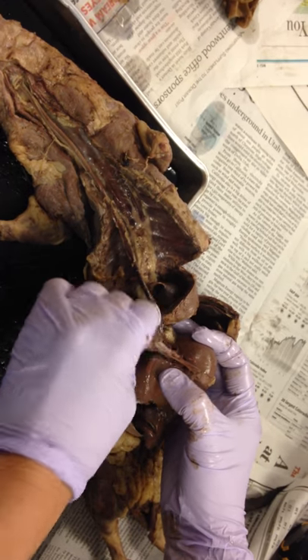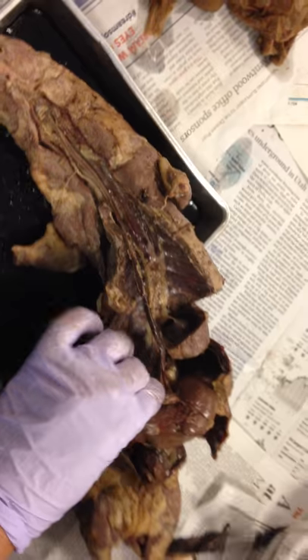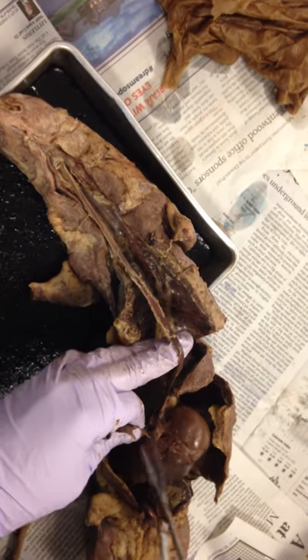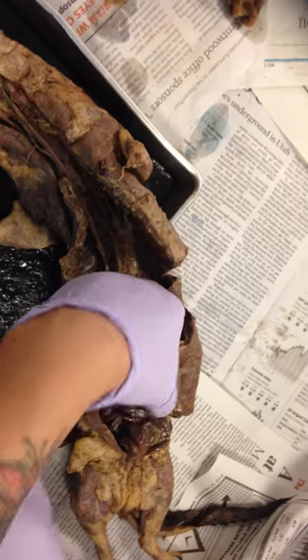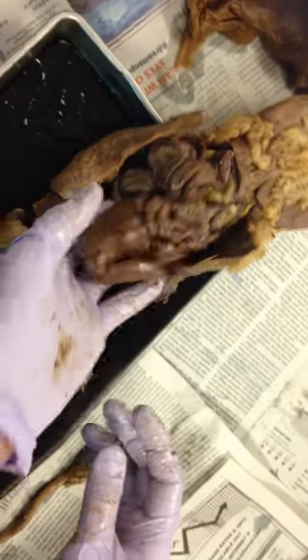You may want to cut through or tear through the back of your diaphragm so it's out of the way. And again, I'm asking myself, where's my esophagus? Because I don't want to cut through that. I want to be able to see my liver a little bit better. Does everybody see the liver pretty well? Okay. Now I'm going to hold the liver, and I'm going to cradle it in my hands like this.